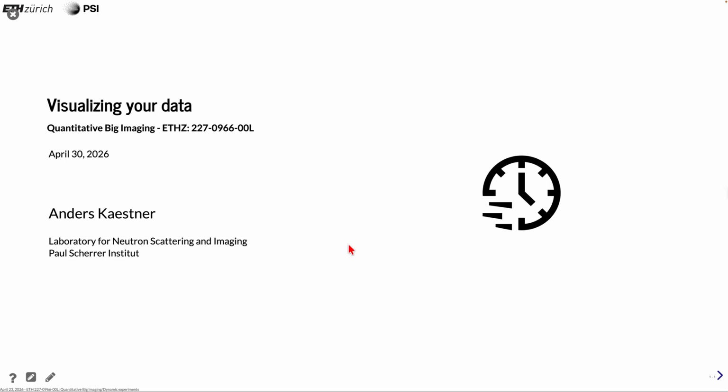Quantitative Big Imaging, Lecture 10, Visualizing Your Data. This is the second part of today's lecture, and it's going to go into more technical, practical parts about the endpoint of what you're working with your data, how to present the results.